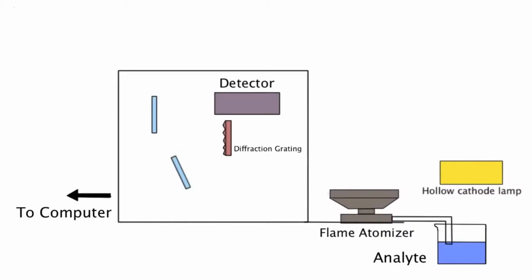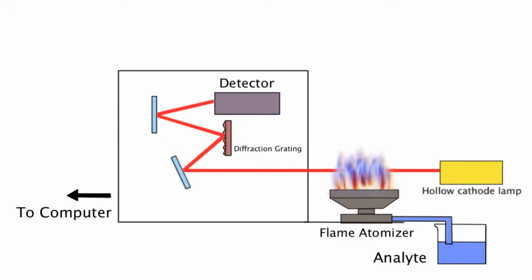This animation of a flame spectrophotometer will provide an idea of how the machine works. The analyte is taken into the nebulizer where it is vaporized and conditioned to provide the best sample for the flame. The radiation source sends light through the flame and into the monochromator. In the monochromator, the beam encounters a series of mirrors that separate the beam from any background light and noise that is not necessary for analysis. This filtered beam finally hits the detector, which relays the data to the analysis software.